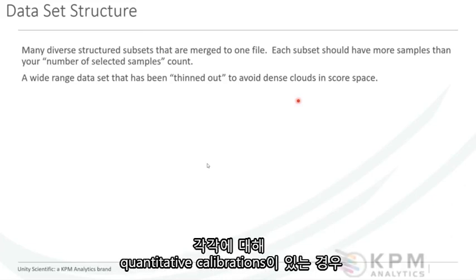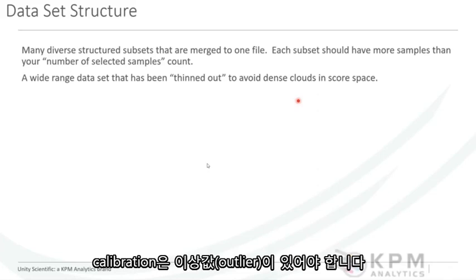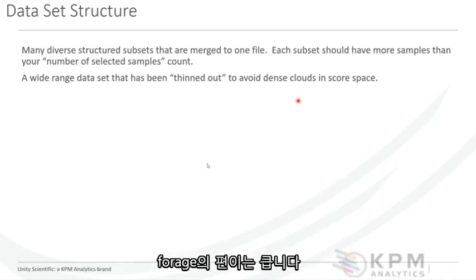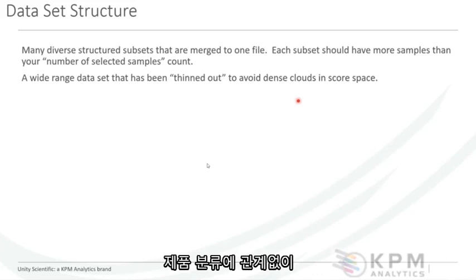If you've got independent quantitative calibrations for each of those hay types, by the time it gets to the analyst, it might have the wrong label on it. So they're going to analyze a grass hay with a legume hay calibration. It should throw some outliers. The outliers will be a little bit high, but the variation in forages is huge. Well, a real advantage of a locally weighted calibration here is that based on the spectra, it's going to reach into your large hay database and find the samples, no matter what their product classification, that are spectrally close, okay?